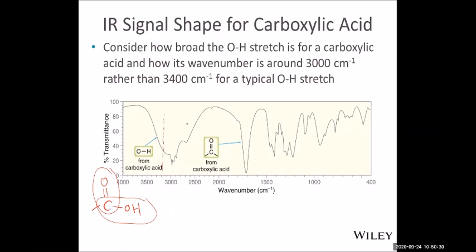This peak comes from the OH that is involved in hydrogen bonding. And the carboxylic acid molecule, even in the gas state, can form hydrogen bonding, because two molecules can form hydrogen bonding to each other. So you have a very strong OH band. And this part comes from the CH bond, below around 3000, very sharp. And there's another one, at 1700. This is very prominent. It tells you obviously there's a CO double bond, a carbonyl.